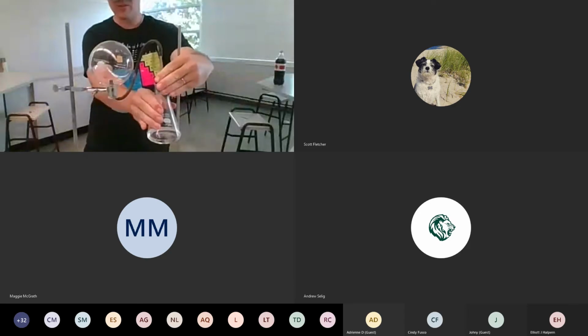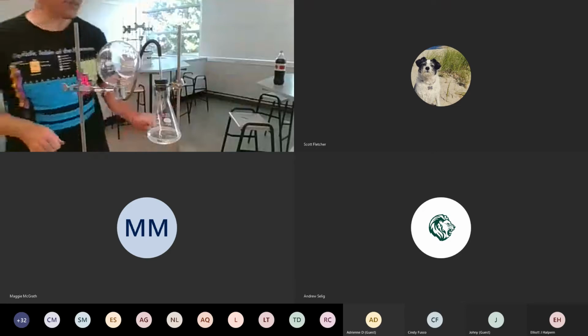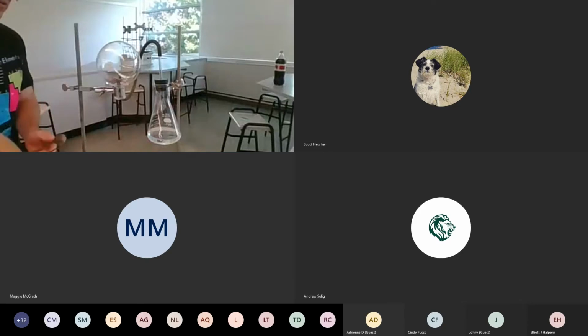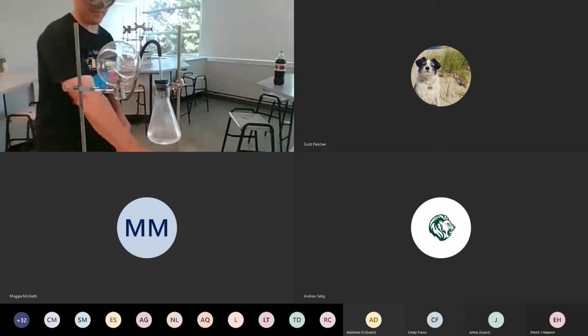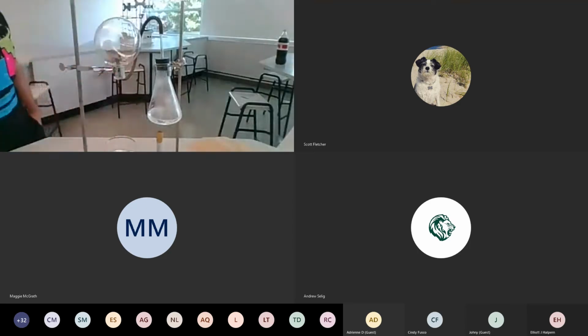It's a similar idea to what was happening with that sodium acetate. Okay, so I'm going to light the Bunsen burner here. Oh, and you see quite quickly, actually, it starts bubbling. Can you see the bubbling?